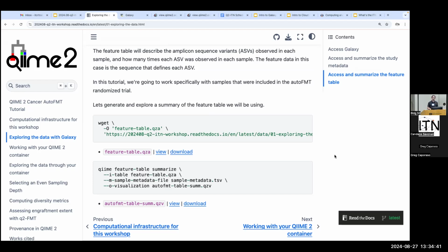So what I do is I use the HPC for the very non-interactive steps where it's just kind of chugging away, doing some data analysis. And then when I'm ready to do the more interactive steps, I'll download those and run them on my computer. Those steps tend to be pretty quick. Sometimes I'll run something that'll take 5 minutes or so, but don't need the 12 hours of tying up the computer for it. And so I'll usually bounce back and forth between doing something in Python and doing something on the command line, even on my own computer.